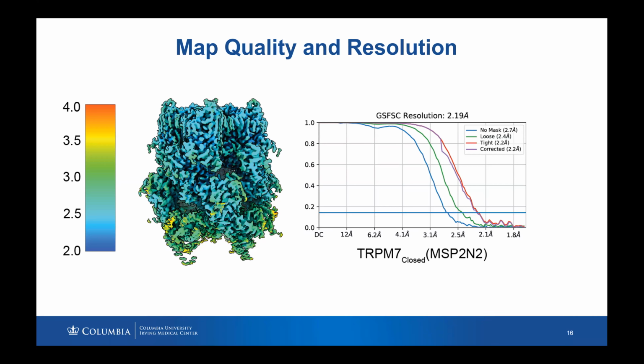With the development of Cryo-EM tools, I expect that if you go back to your previous collections, collected 3 or 5 years ago, you can squeeze more and more from those data sets. So I don't know, but maybe with the development of Cryo-EM tools, it's going to be easier to classify those low abundant, low populated states.